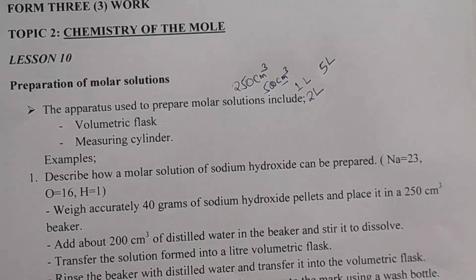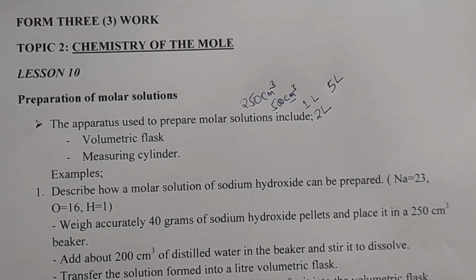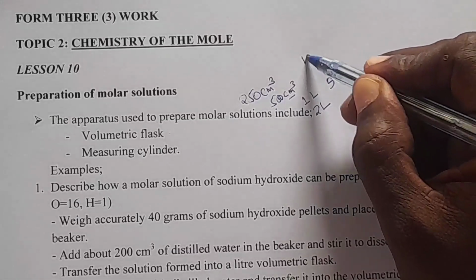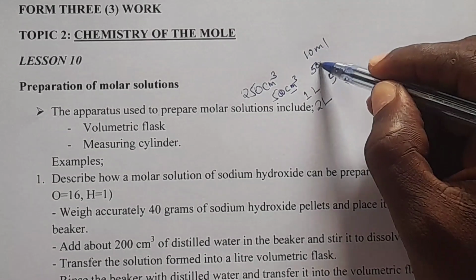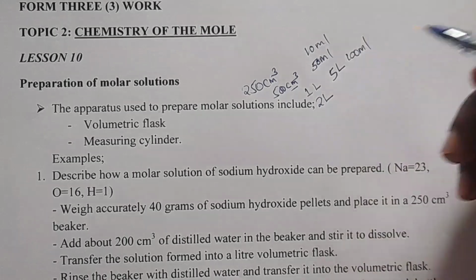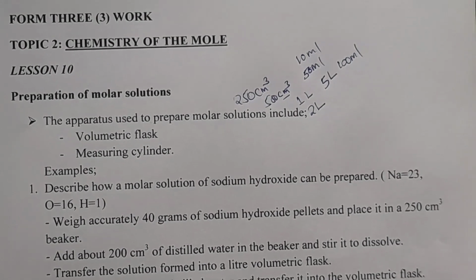So we have again measuring cylinders, the same again. Measuring cylinder can come with different measurements, like you can have one with 10 ml or 10 centimeter cube, or one with 50 ml or 50 centimeter cube, or you may come with that of 100 ml, a measuring cylinder in plastic or in a glass form.